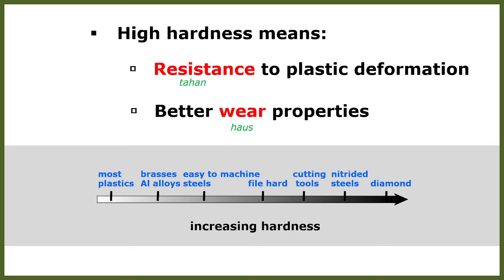You can see below the hardness of a material, with different hardness for each class of material. Normally plastic has the lowest hardness, followed by aluminium and also brass, and diamond is the hardest material.